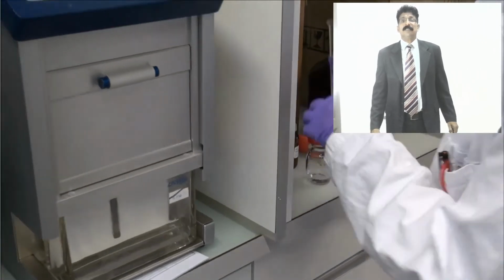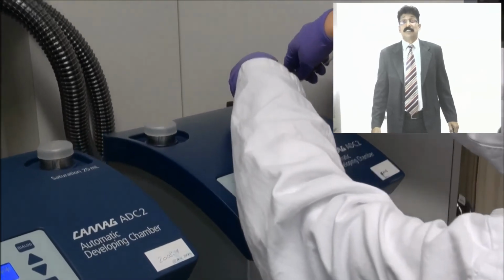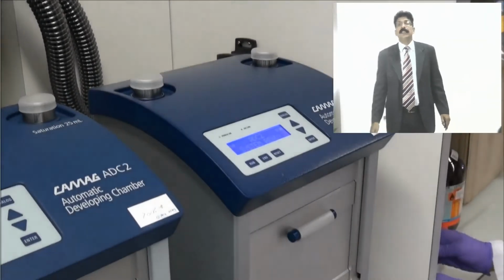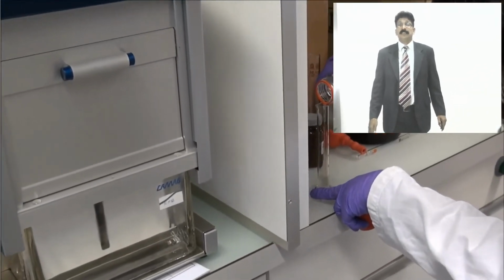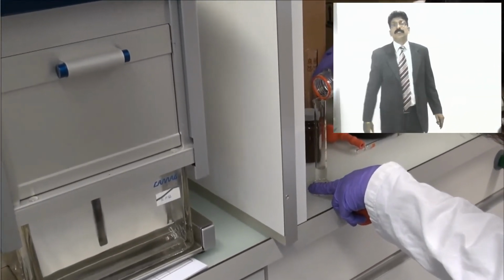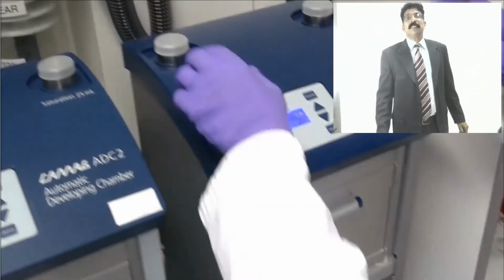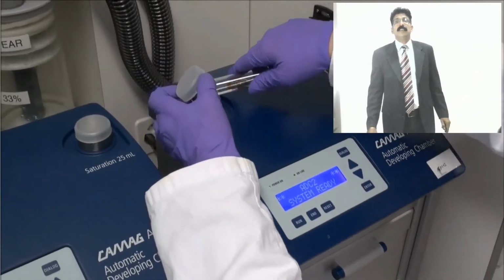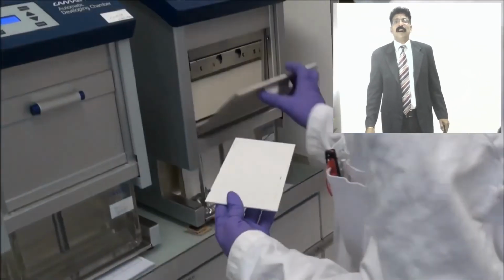This is for 10 ml for the developing, and again she is taking separately for saturation. This side there is one provision for adding for saturation. You have to add 25 ml here. And then after adding you can keep the plate.